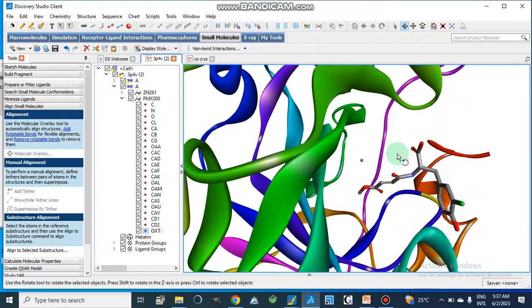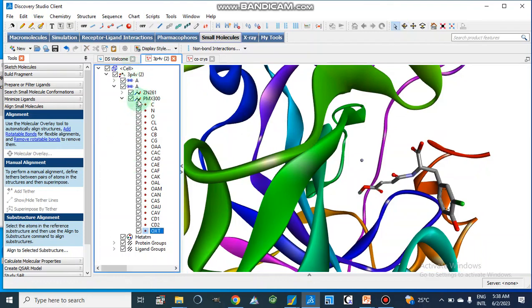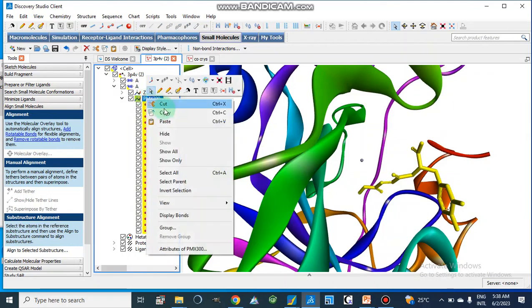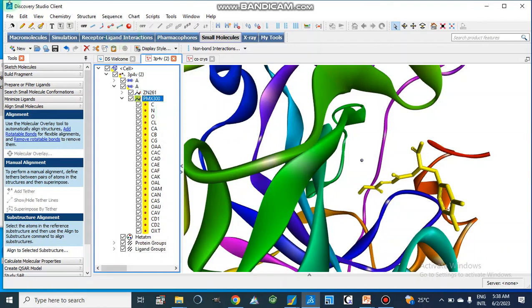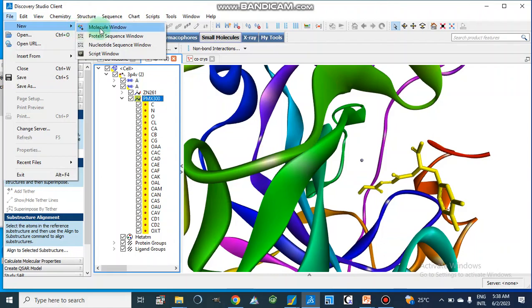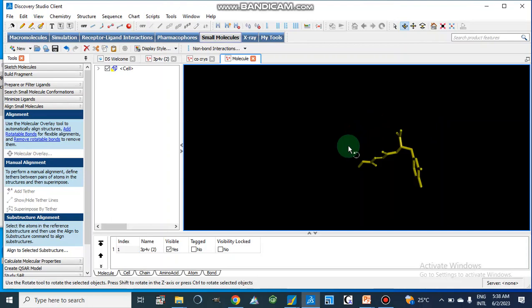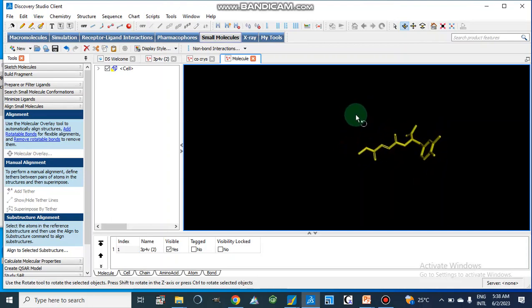After taking this, we will select the compound which is the co-crystallized ligand. Here it is PMX 300. We will copy it, then open a new molecular window, paste it there, and after this we will optimize and minimize this structure in MOE.